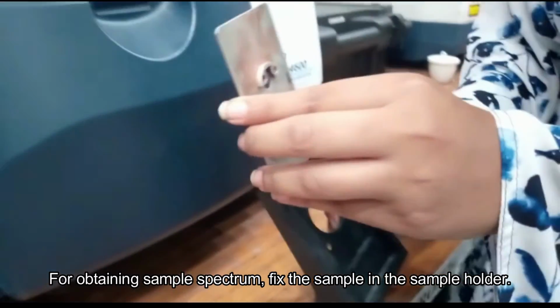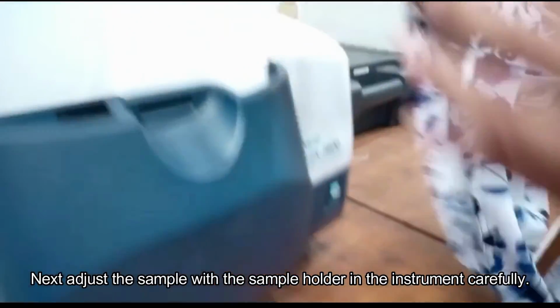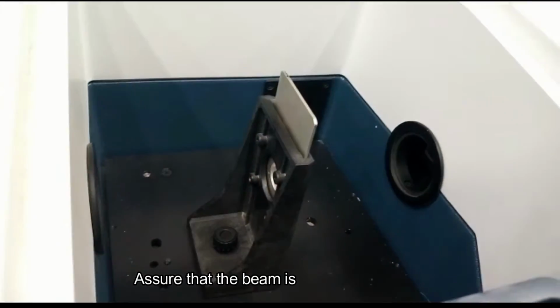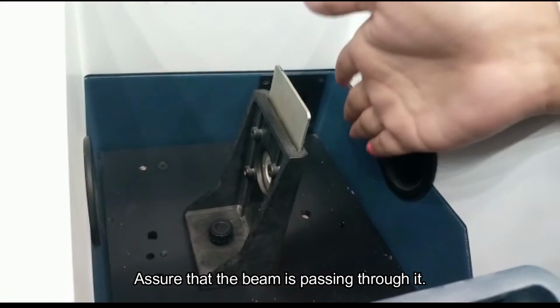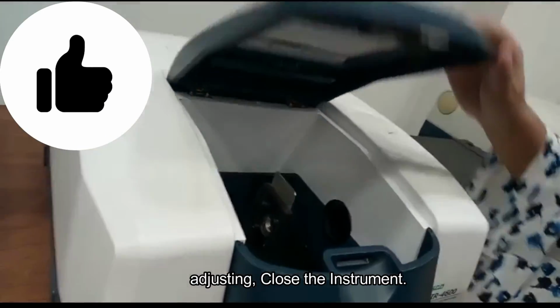To obtain the sample spectrum, fix the sample in the sample holder. Next, carefully adjust the sample with the sample holder in the instrument and ensure that the beam is passing through it. After adjusting, close the instrument.